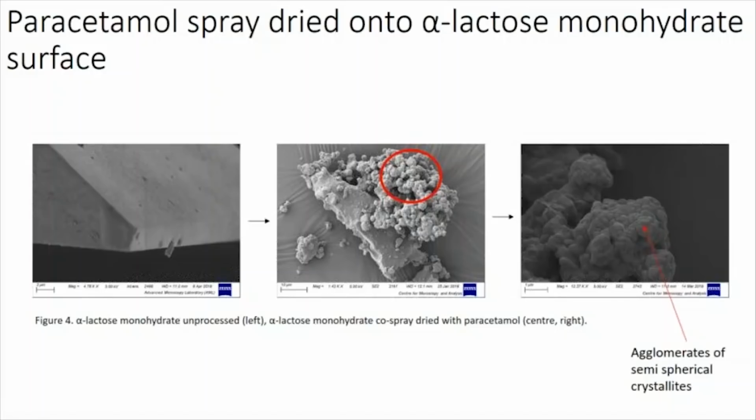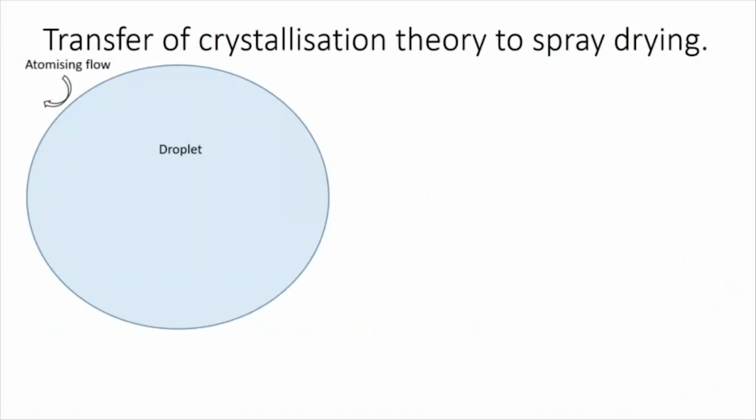What is important to note, however, is that the surface morphology of spray dried materials depends both on the spray drying parameters used, but also on the nature of the material that is being dried. Particles ranging from highly crystalline materials with defined crystal faces to amorphous materials with a hollow core and no defined shape can all be produced depending on what material is being dried, the choice of solvent, the inlet temperature and corresponding outlet temperature, the solvent mass flow rate, the atomizing gas mass flow rate, and the drying gas flow rate which is used.